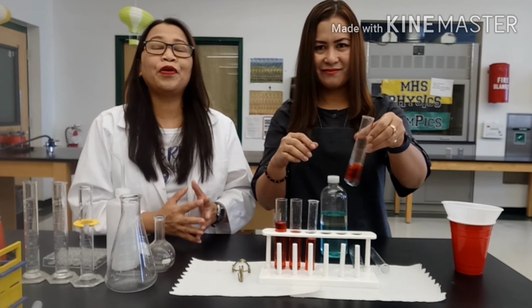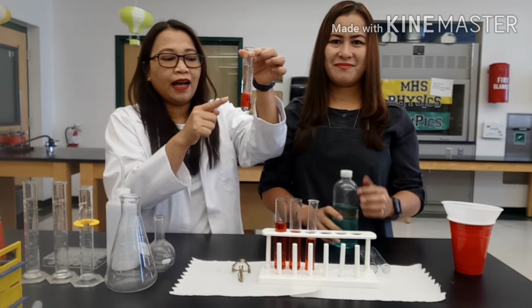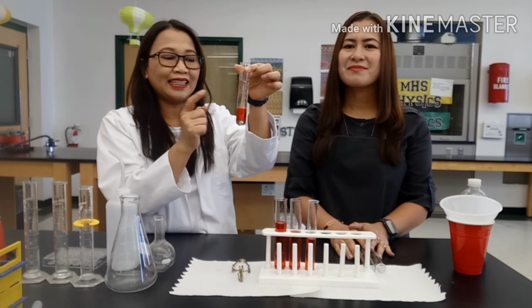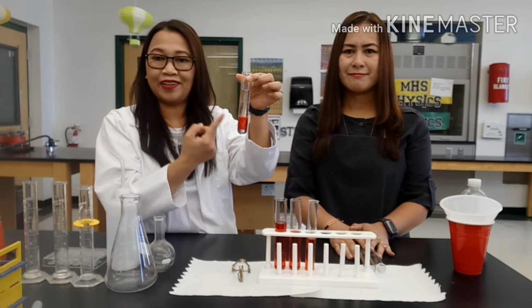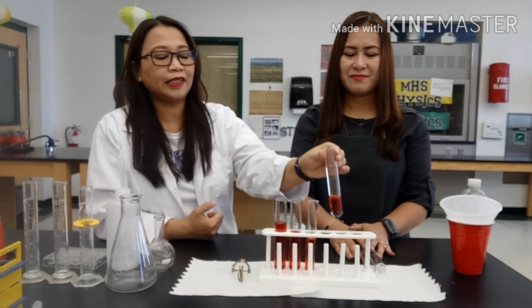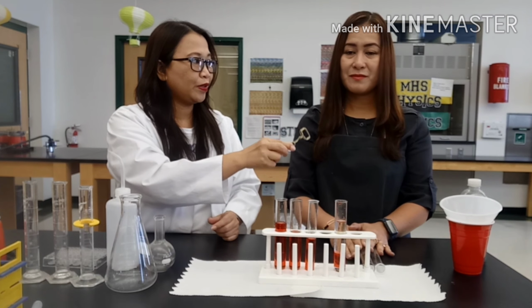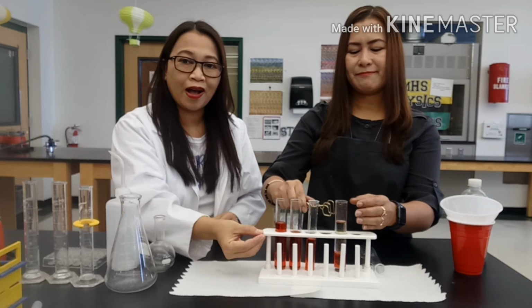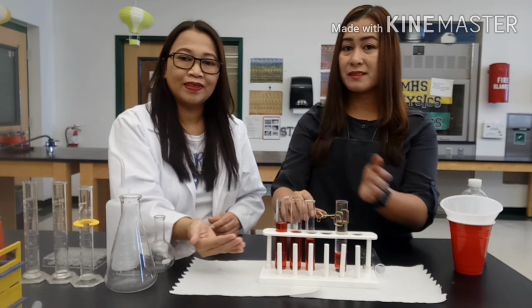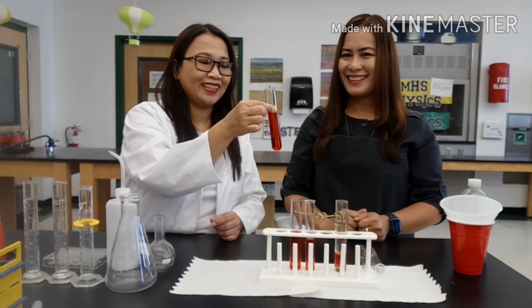But we all know that water and oil have different densities. That's why they will not mix. You will see here that we have two different liquids inside the test tube. One is the water, and the other one is the oil. So again, the test tube is also used to mix liquids aside from containing liquids. All right. Again, the test tube clamp is used to hold your test tube, and the test tube rack is used to hold your test tubes when you have several. And the test tube is used to store a small amount of your liquids. Get it?